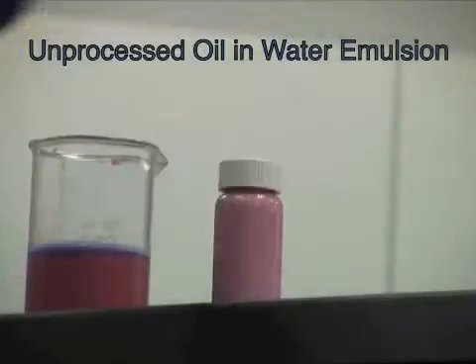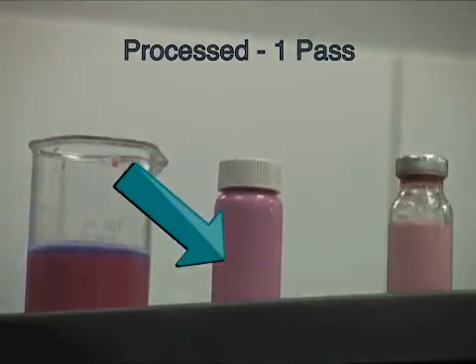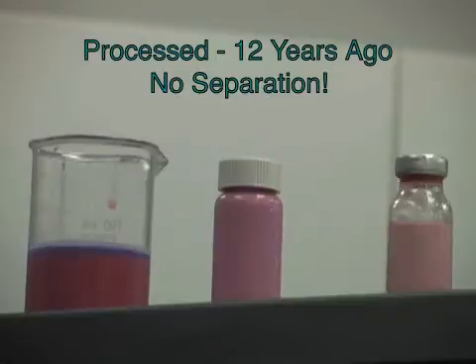Here you can see the original oil and water vials we started with, the product we processed on the LV-1 in a single pass, and a vial that was processed 12 years ago on a similar microfluidizer processor. The nanoparticles are so tightly dispersed that the emulsion has remained stable and will continue to do so for years to come.